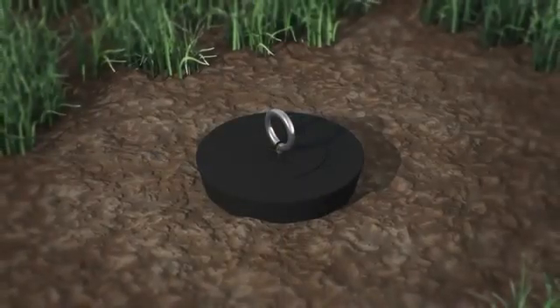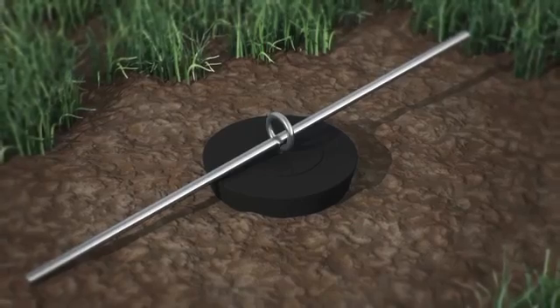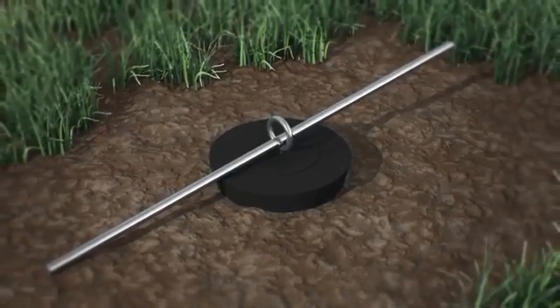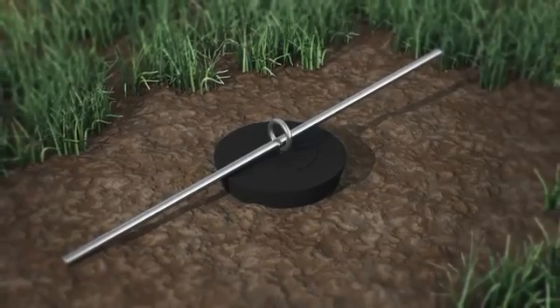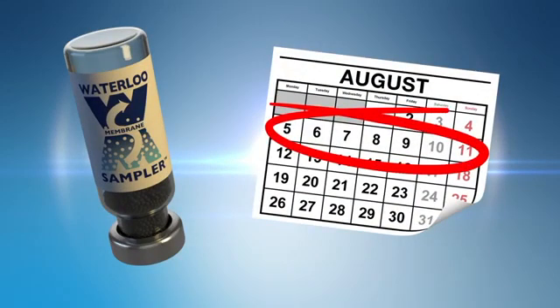If desired, thread a piece of doweling or steel rod through the eyelet at the top of the rubber stopper to prevent the rubber stopper from sliding into the borehole. This may also aid in removing the rubber stopper when collecting the sampler. The duration of sampling depends on the reporting limits required; one to two weeks is usually sufficient to provide reporting limits that meet most soil gas screening levels.